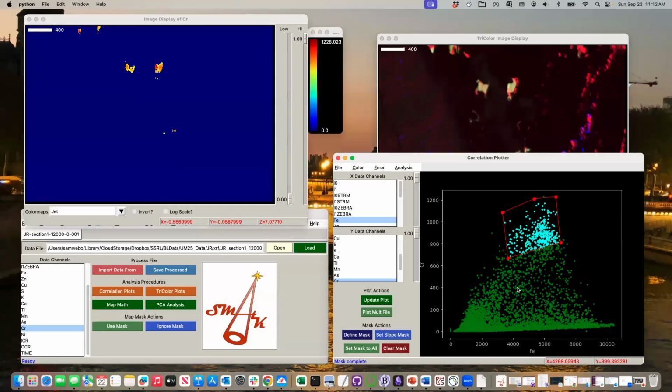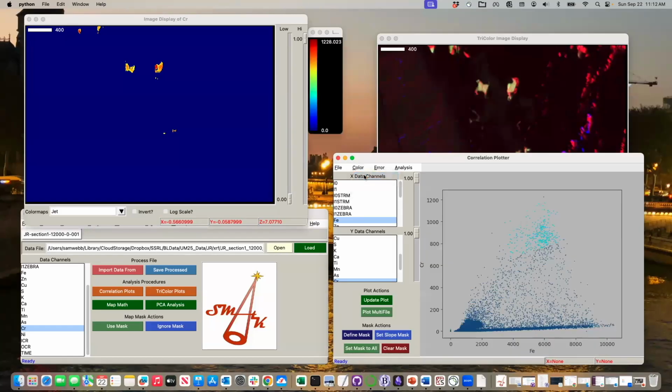I often work in a dark room, and so I like dark backgrounds. If you're trying to save your ink somehow, you can always say swap colors, and it'll give it a whiter background and darker colors. It all depends on what you prefer. And smaller dots if you do the swap one. Go back to swap colors.